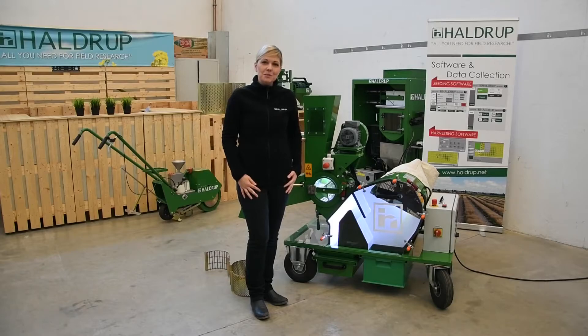Once again we will show you this machine in action. We will be threshing some cereals which are difficult to thresh with this machine.